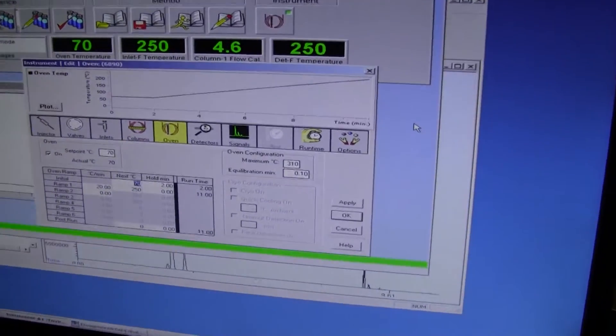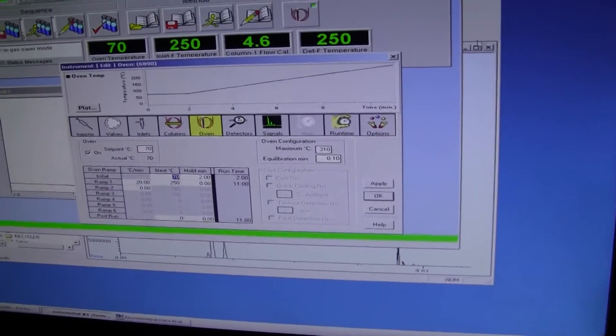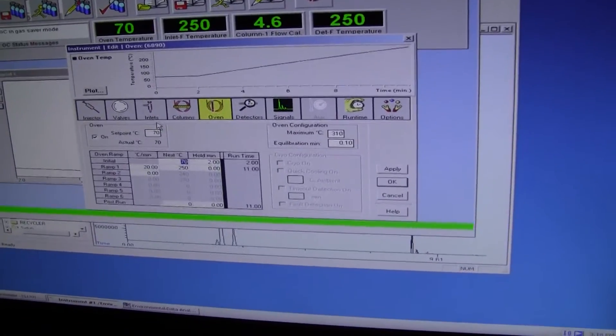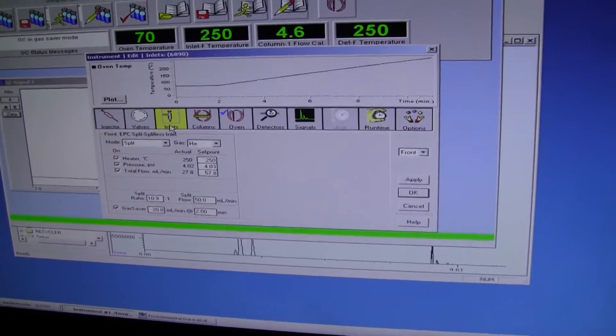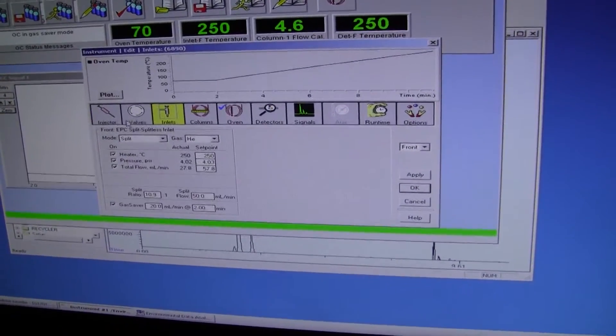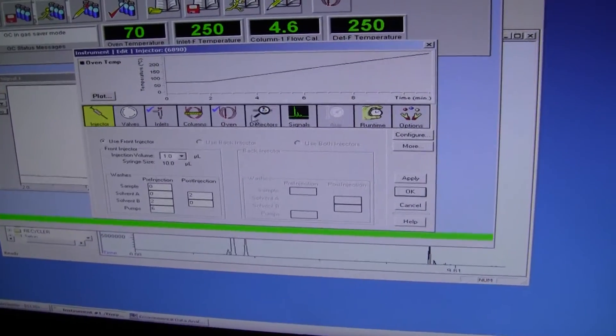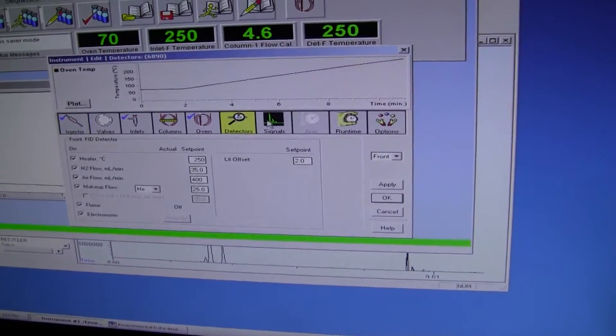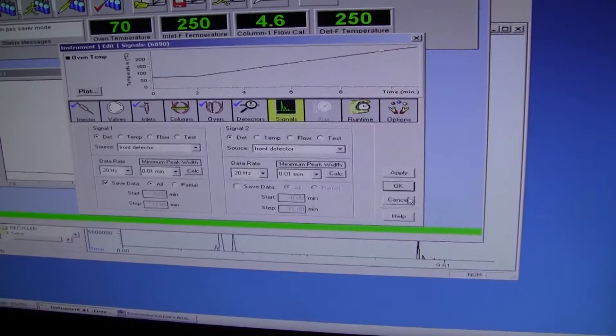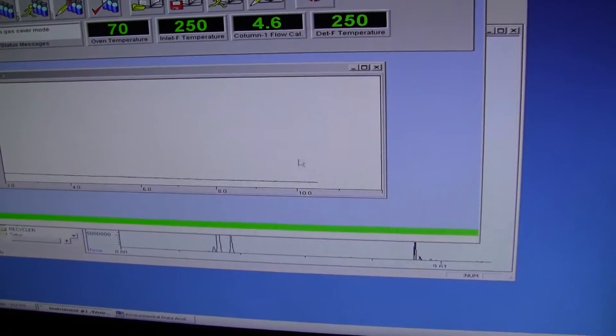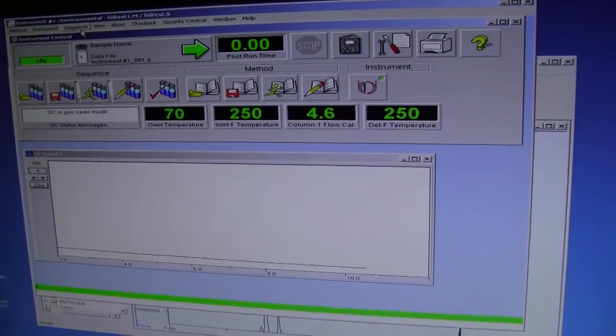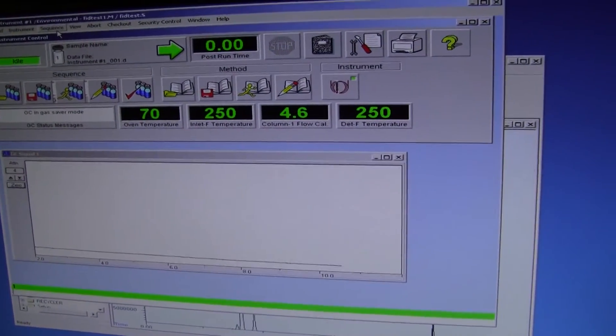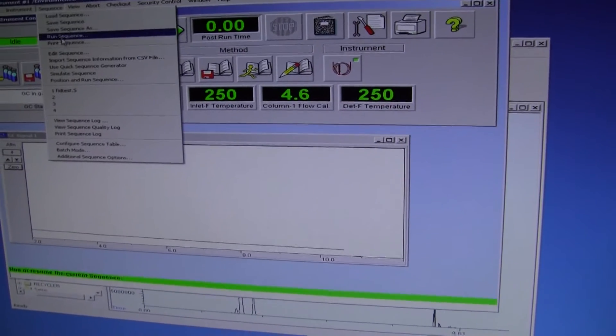What we're doing here is looking at a few of the characteristics that we can control, some of the parameters, inlet valves, injectors. Very easy to get to. You can see the oven temperatures, inlet, the column flow.